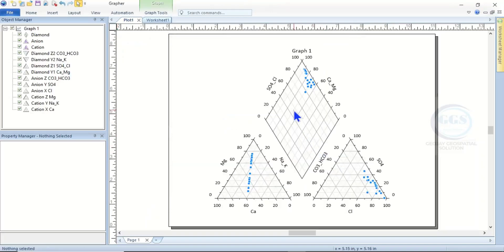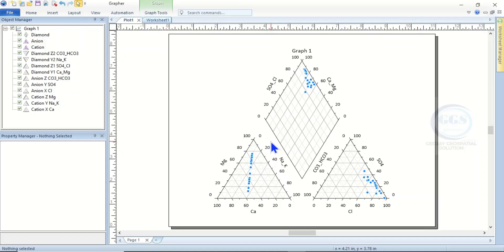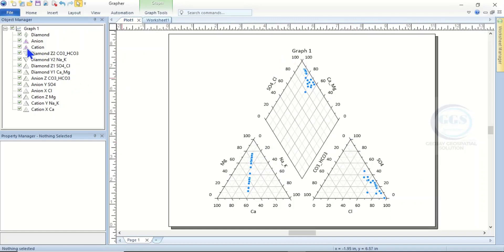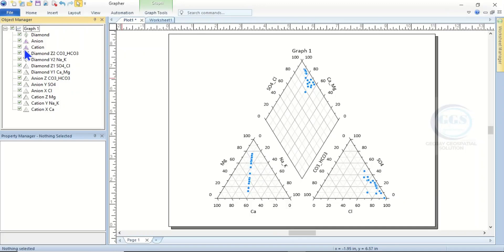As you click on Open, the software will automatically plot the Piper trilinear diagram for you. This is the cations, this is the anion, and this is the diamond. You can verify it here - this is the diamond, the anion, and the cations.